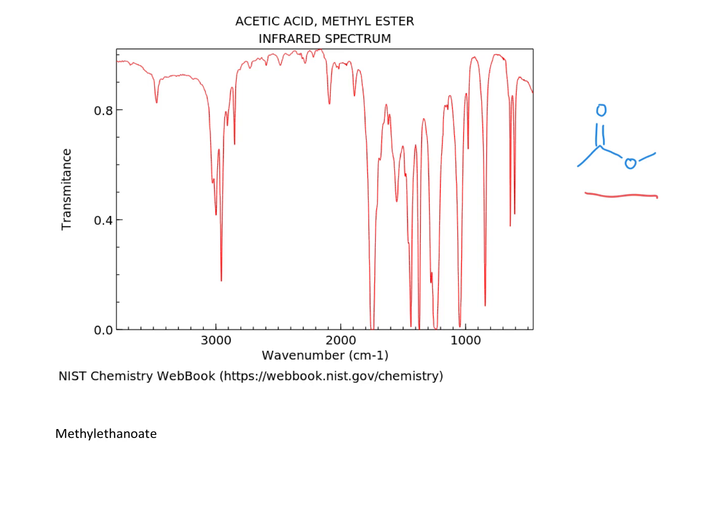And in infrared spectrum, what we're looking for is what are the functional groups. That's all we're looking for. We're not looking for what is the exact structure of this. Most of the time we can't see that. But what we can see is what type of functional groups we have.